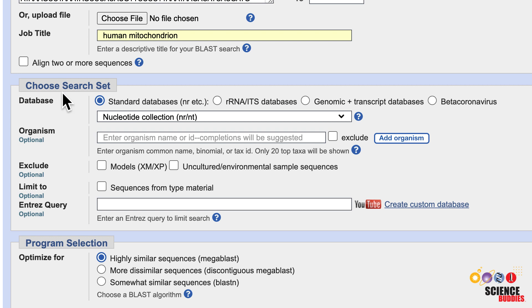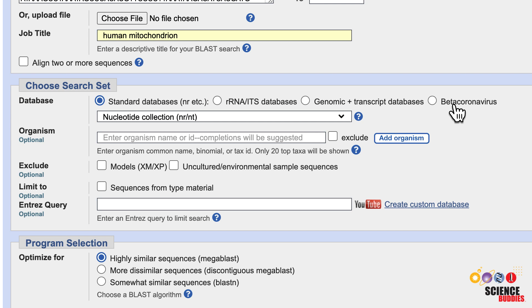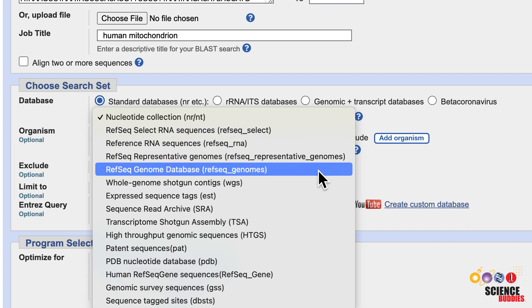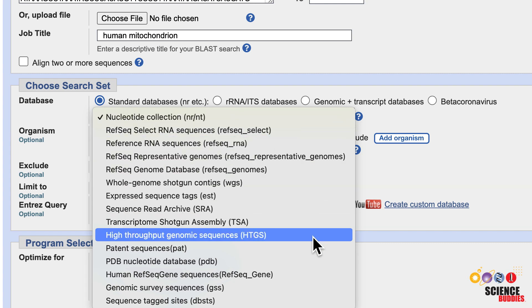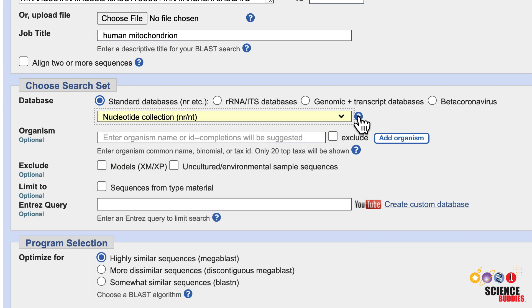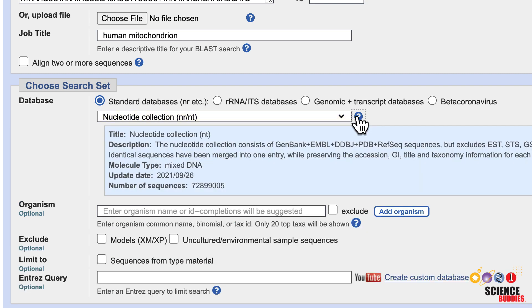The next section allows you to define your search settings. You have several database options that you can choose from. Ideally, you want to search the smallest database that is likely to include your sequence of interest to get the most significant results. Choosing subsets of databases is possible from the drop-down list. Clicking on the question mark allows you to check what sequences are included in that database.